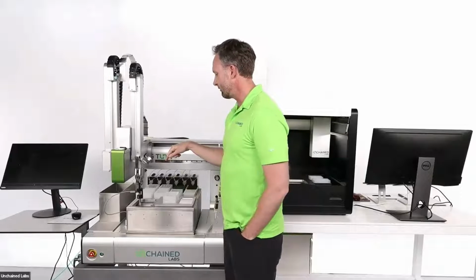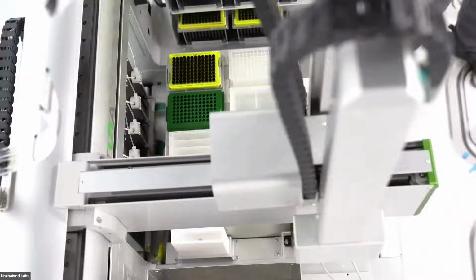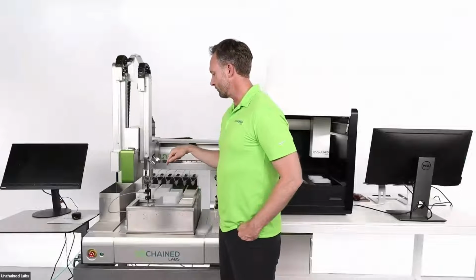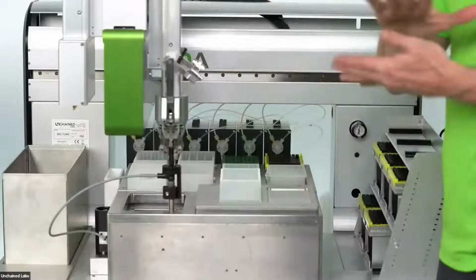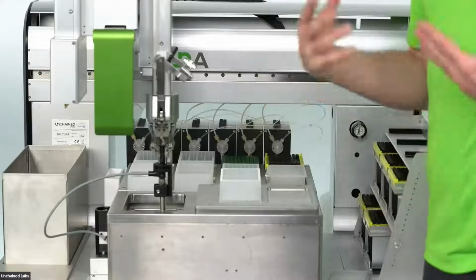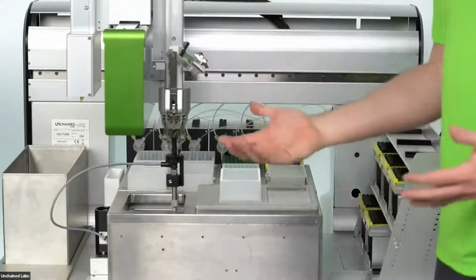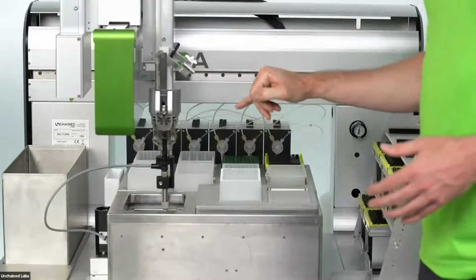What you're seeing here is that volume measurement that happens at the beginning of the run. And this is a very key part of this solution. This isn't something that you're going to find in many other platforms. And right now, the volume sensor is actually measuring the 4 corners of the plate. It does that to make sure that it's in perfect alignment, which it's seated in there pretty well. So through mixing cycles and whatnot, it does stay seated. But in the off chance it moves, this sort of calibration of the different 4 corners is done.